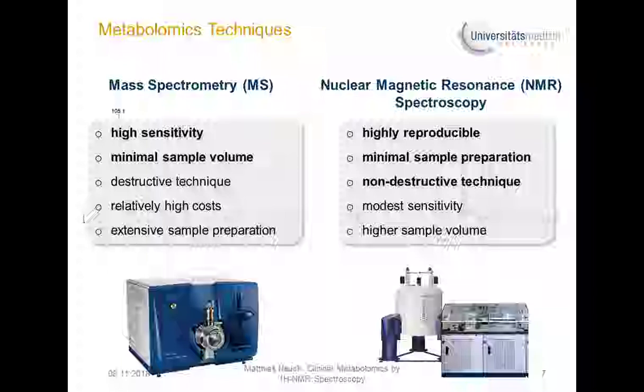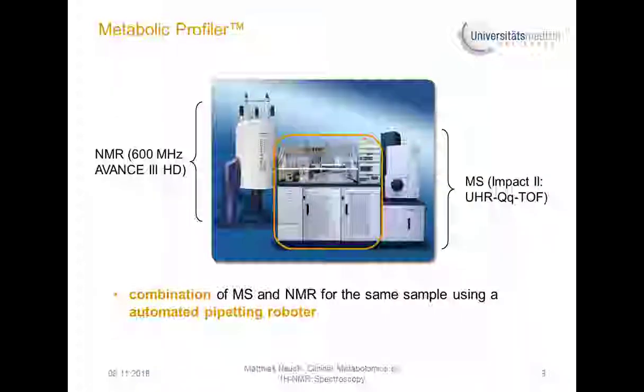On the other side, the NMR is highly reproducible, a very important aspect I will show you later. We need only minimal sample preparation, and one of the favorites is that it is a non-destructive technique. The sensitivity is lower in comparison to the MS, and in general, we need higher sample volumes.